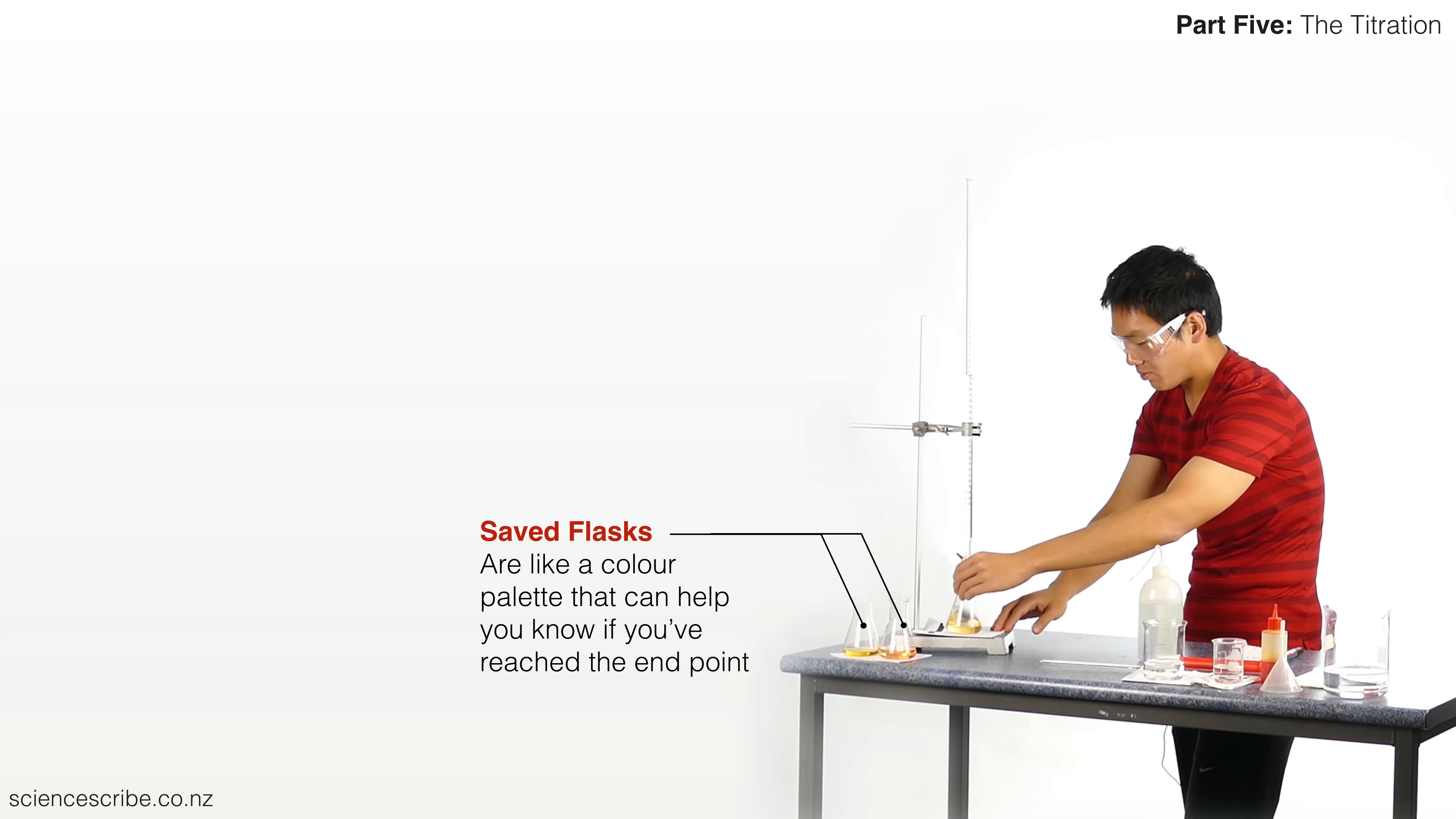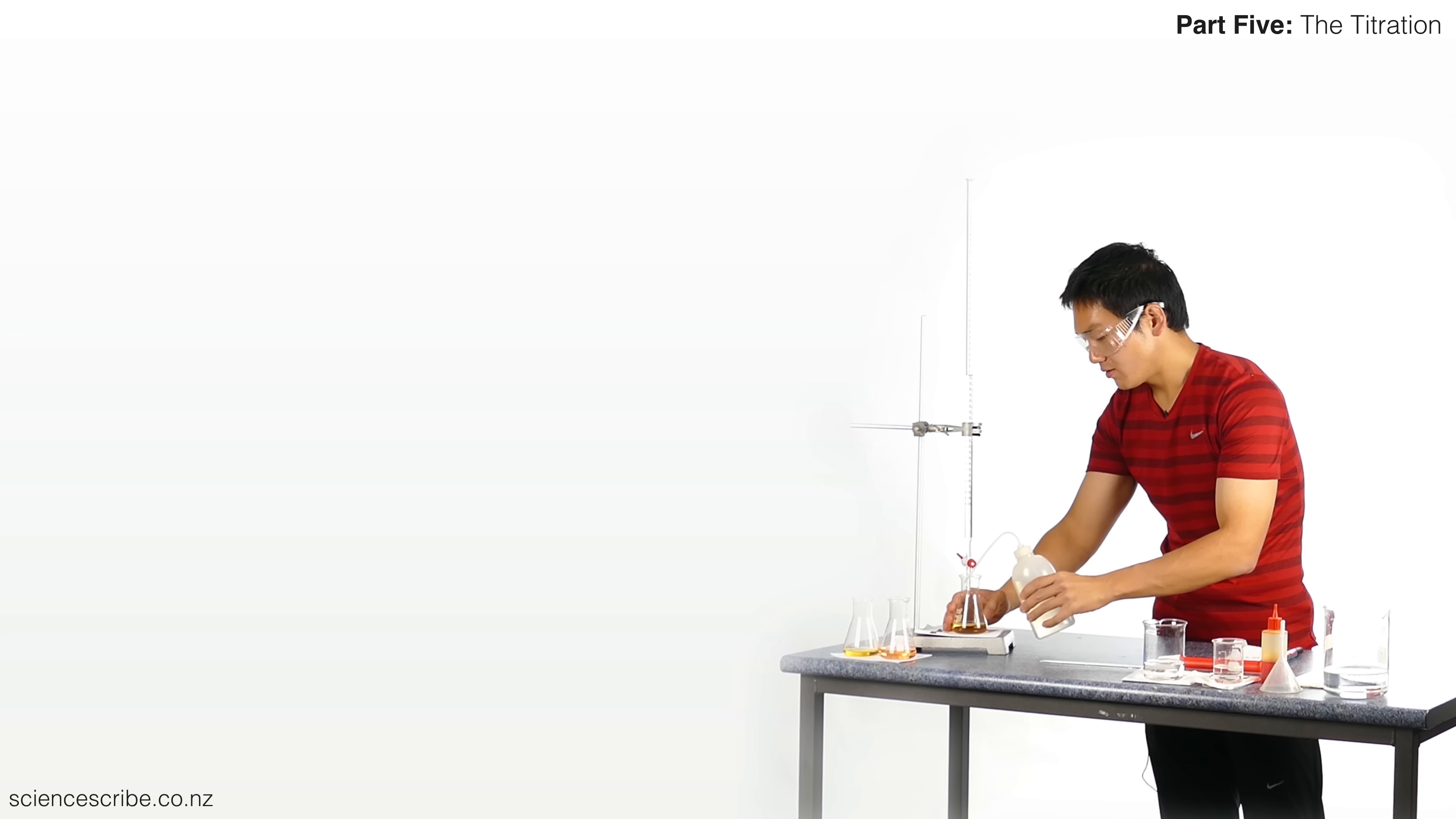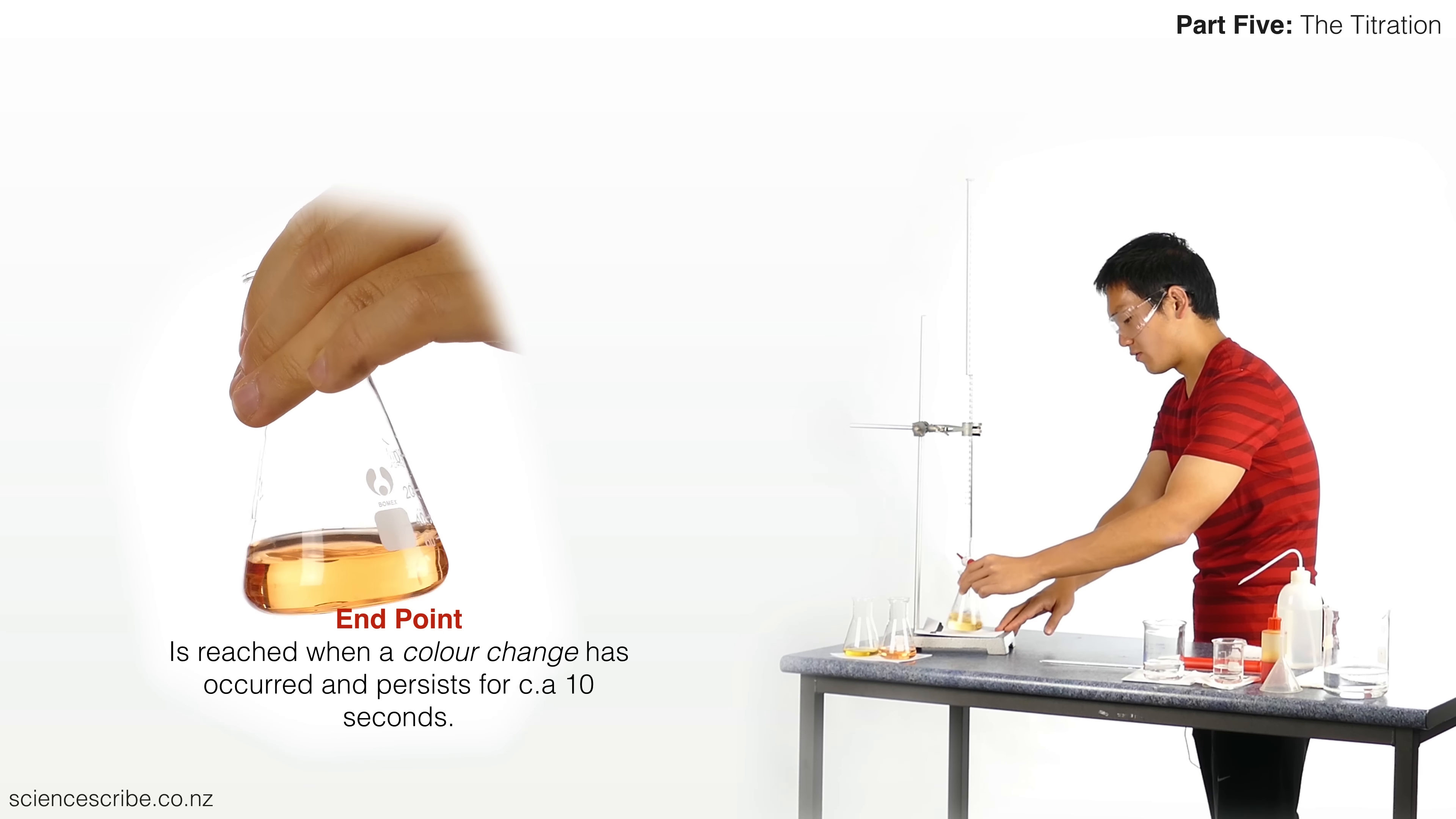So I'm paying attention to how long the pink takes to disappear. Oh, okay, now at this point from the swirling I've still got chemicals hanging off on the walls. I still have a single drop hanging off the end of my burette, so I want to touch that to the tip, and then I'm going to wash everything down. I'm also going to swirl it, and I'm going to swirl it for ten seconds to make sure the color stays. Ten, nine, eight, seven, six, five, four, three, two, and one.